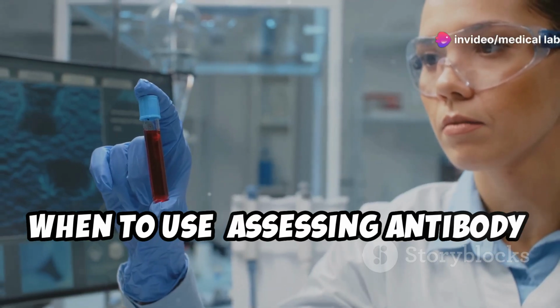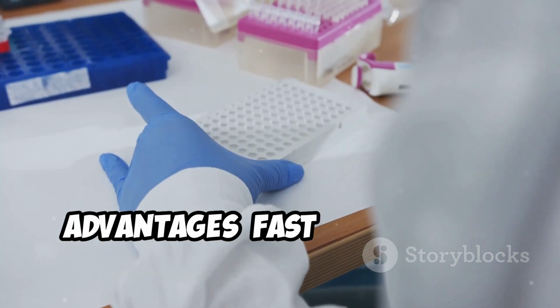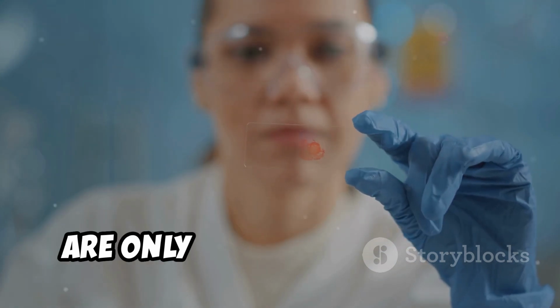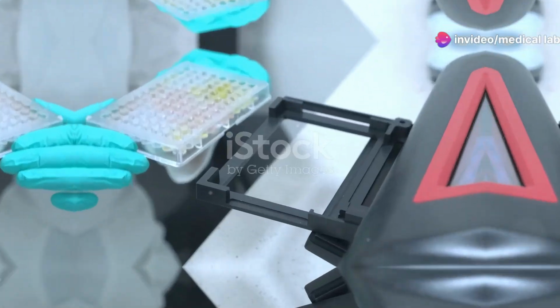When to use: assessing antibody affinity and specificity. Investigating blocking or inhibitory interactions. Advantages: fast and simple protocol. Disadvantages: less specific since you are only using one antibody. Potential for high background if all proteins from a sample are immobilized in the well.